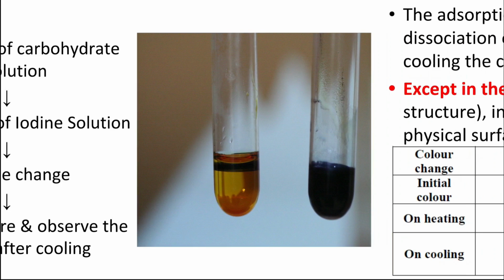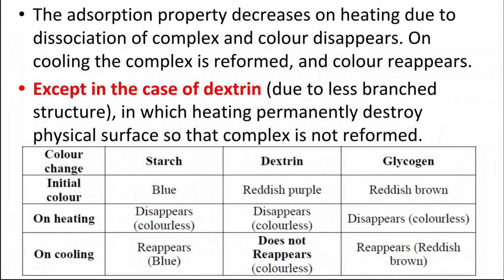Now, this property of adsorption decreases when there is heating, because the complex dissociates and the color disappears. But when you cool the complex, the color reappears, except for dextrin.